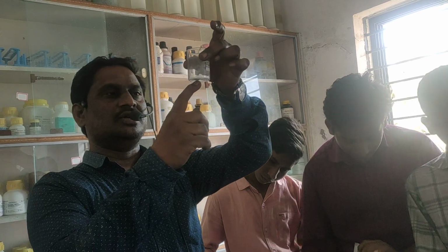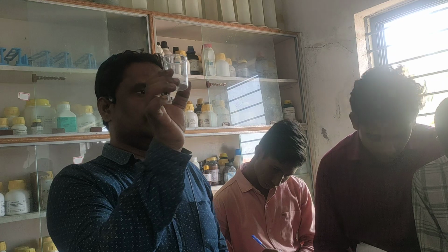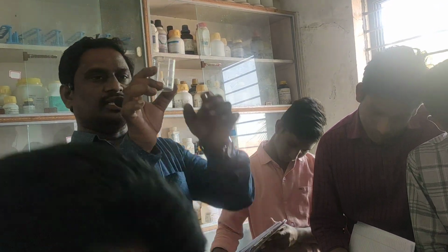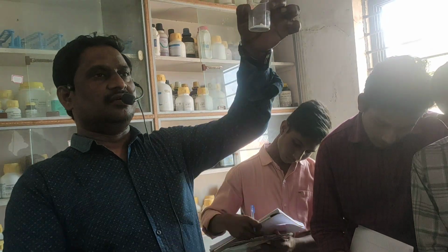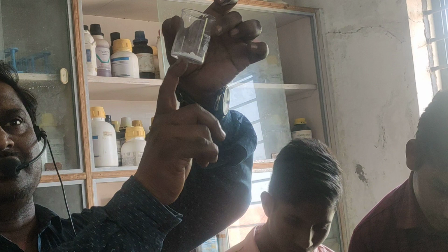CO3 minus 2 may be present. So for an amorphous salt, carbonate will be there. Next, see the color, all of you. Second point, read all of you: Color. What is the color?